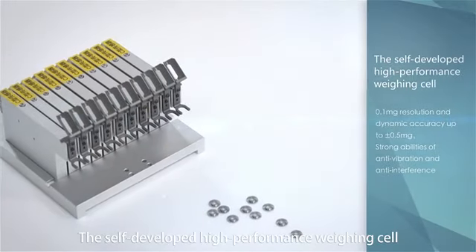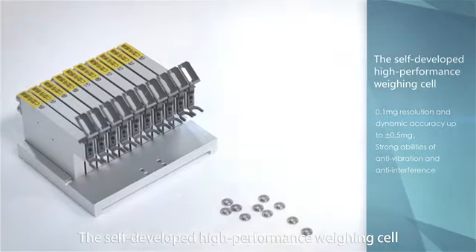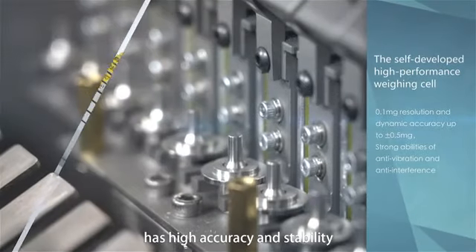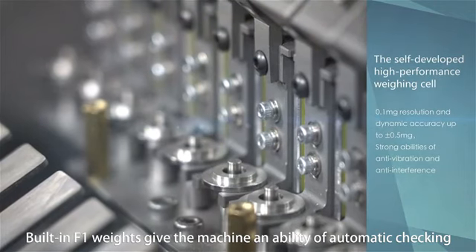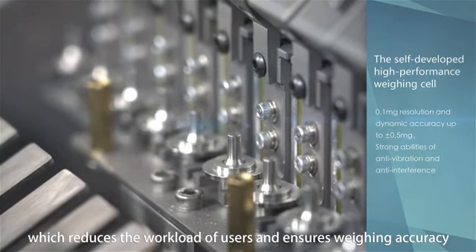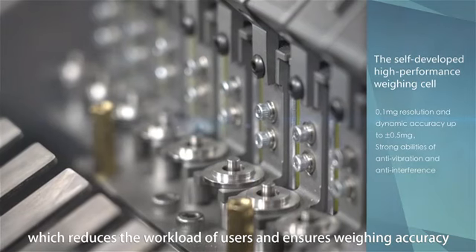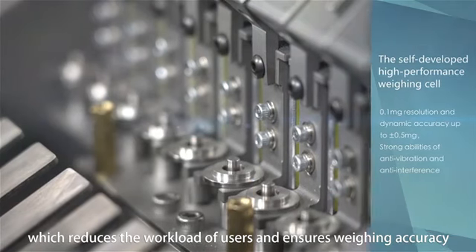Superior Performance. The self-developed high-performance weighing cell has high accuracy and stability. Built-in F1 weights give the machine an ability of automatic checking, which reduces the workload of users and ensures weighing accuracy.